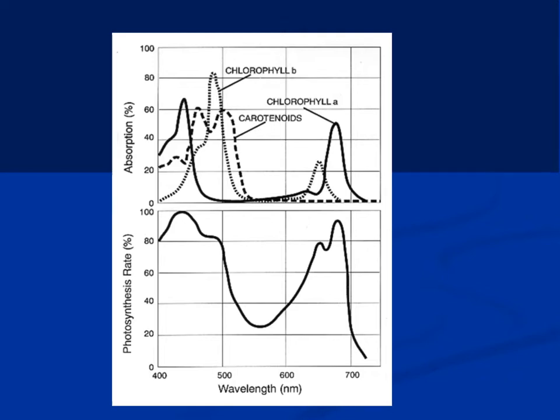This gives an example of certain spectra you can see when you are running UV visible spectroscopy. This is an example of chlorophylls. There are chlorophyll A and B as indicated here. Certain groups are present in chlorophyll A and B, and if you go back to food chem, we talked about some hydrolysis which can happen while we are processing or storing chlorophyll containing foods.